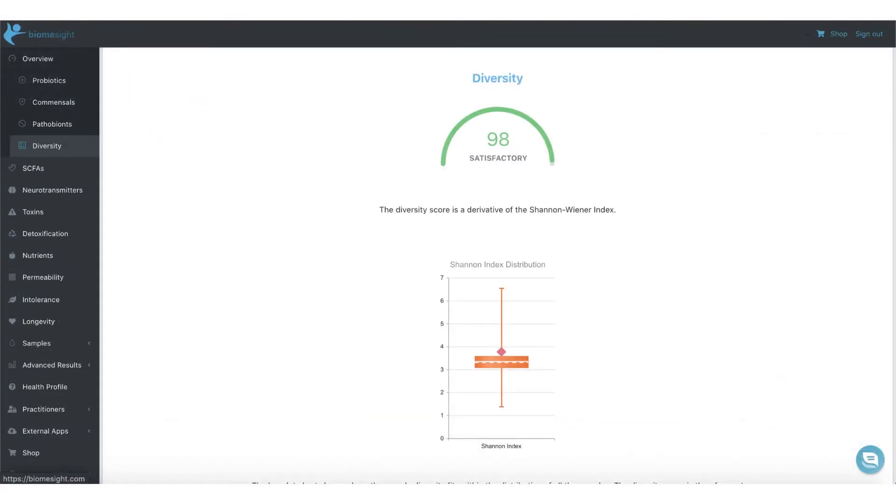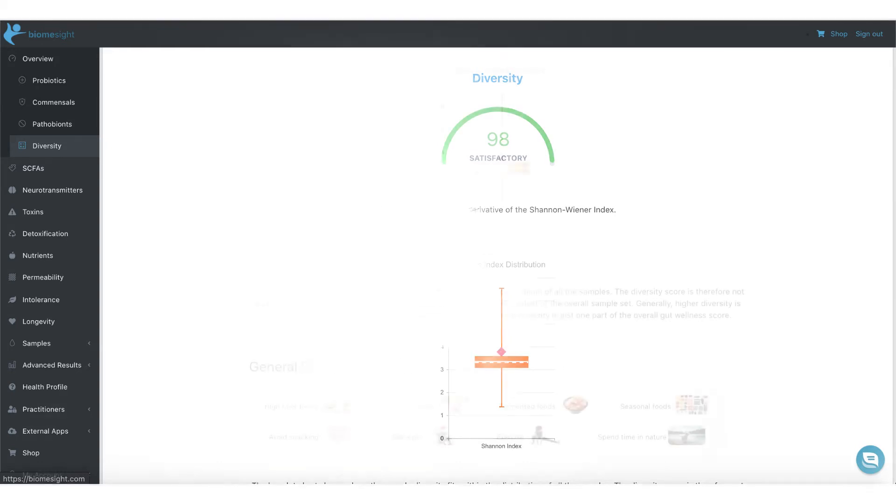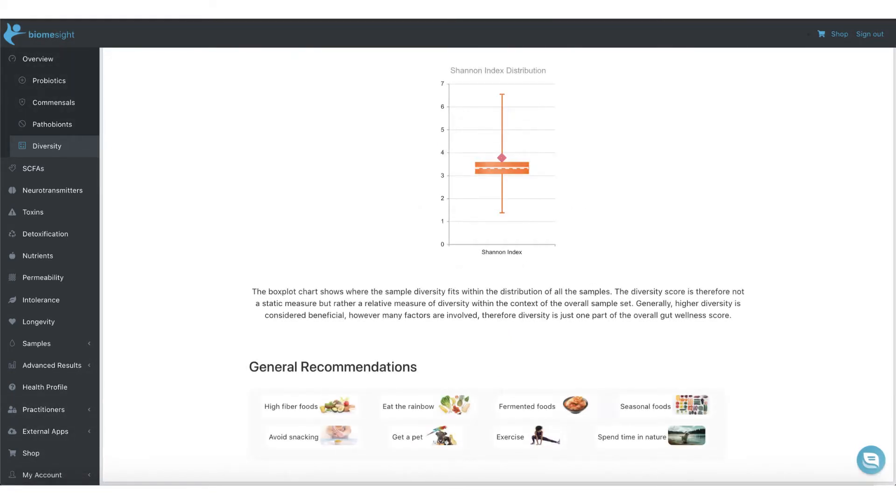Starting with diversity, the diversity score is calculated using the widely used Shannon-Wiener index and provides an indication of the variety of bacteria compared to others.